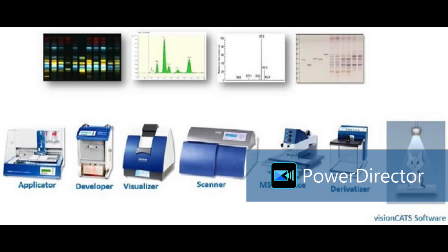Before we proceed, one more. On behalf of them, I am only asking. We have this technology coming with no sample preparation, like UV-visible. Earlier we used to do preparation of the sample, then load. Now we are getting NanoDrop kind of technologies wherein there is no preparation of the sample.